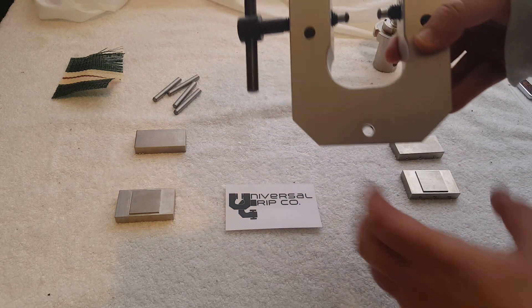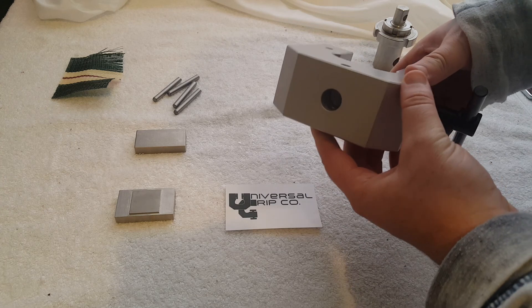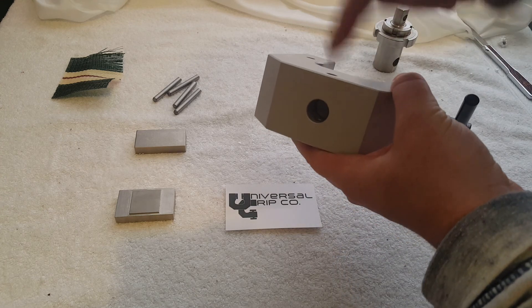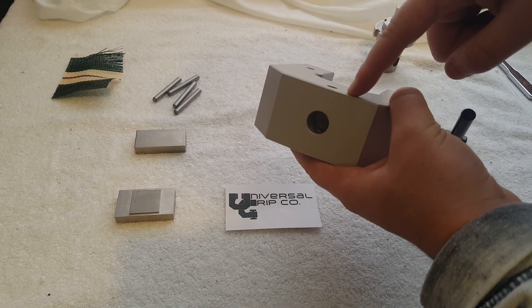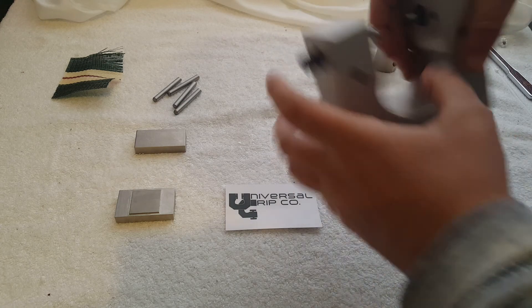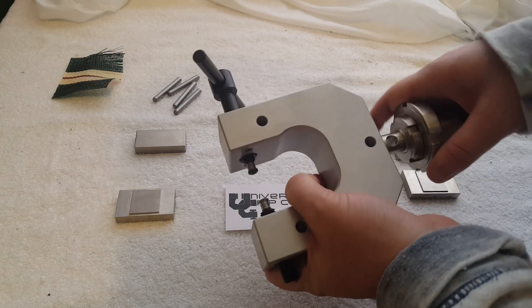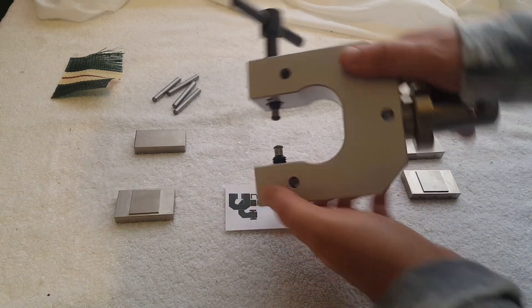This is our 5kN vise grip, good to about 1000 lbs or so, and it attaches onto the machine via a clevis pin coupling. The main pin is 5/8ths inch in diameter and there is a 5/16ths inch locking pin. With our adapters, these can fit onto virtually any universal testing machine out there.